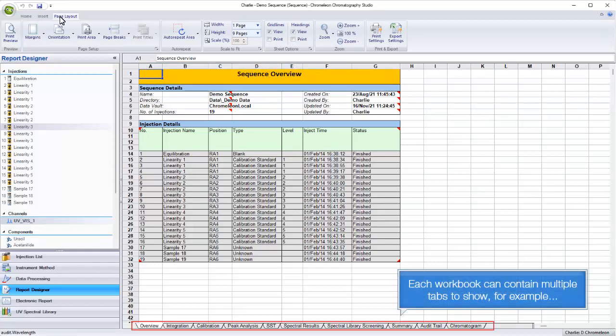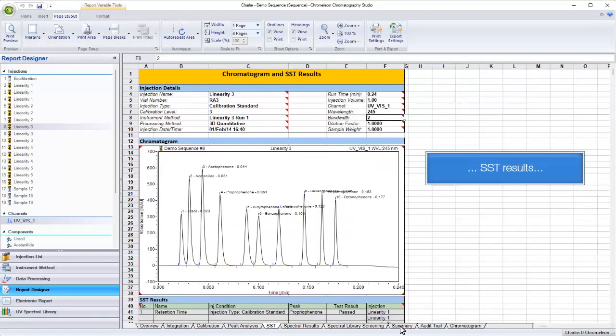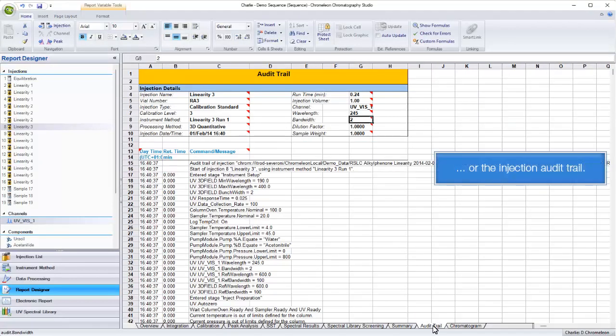Each workbook can contain multiple tabs to show, for example, calibration data, SST results, a sequence summary, or the injection audit trail.